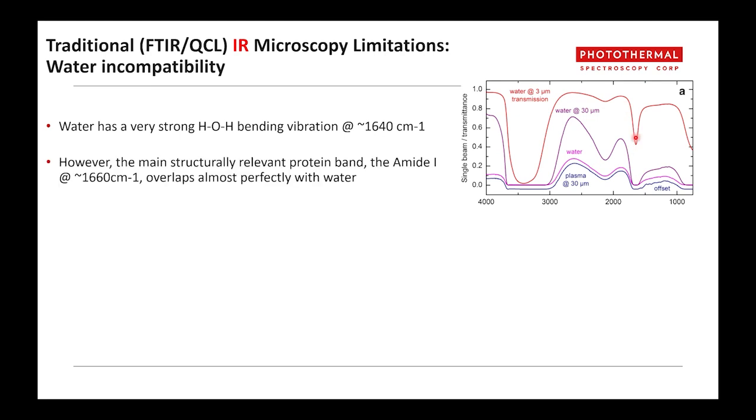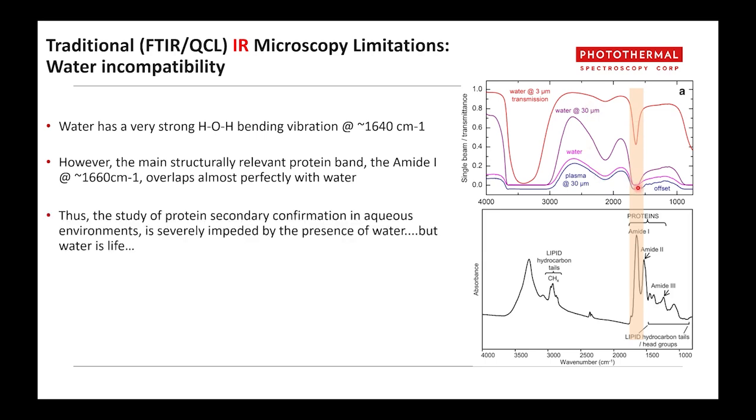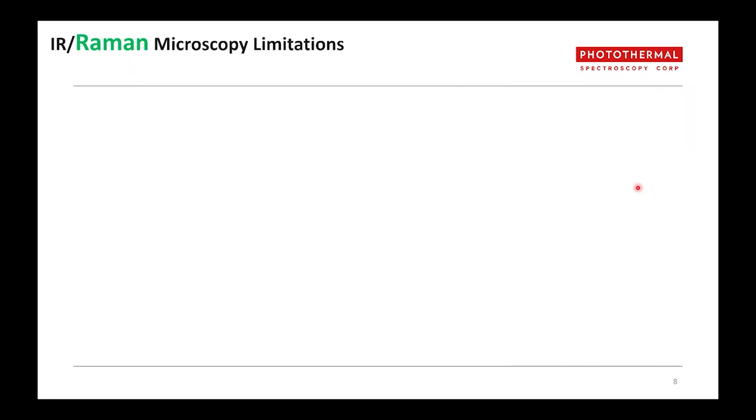However, by some stroke of bad luck, that overlaps exactly with the main protein bands. So the protein bands are often obscured by this dip in transmission because water absorbs. And the more water you have, the less light you have coming through, which is unfortunate because water is life. That makes things much more difficult.